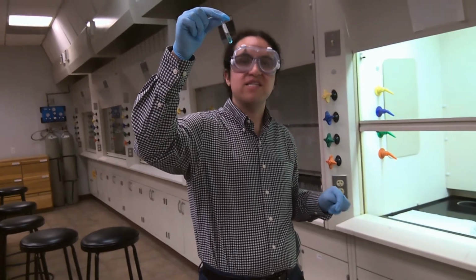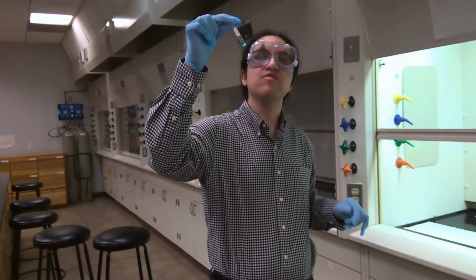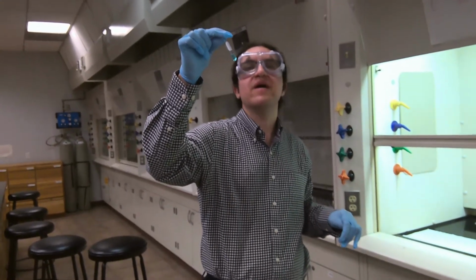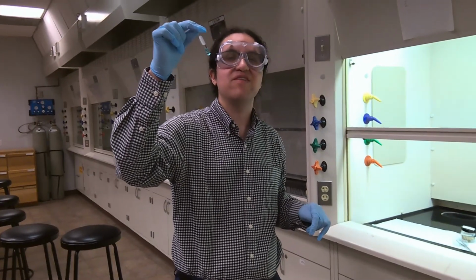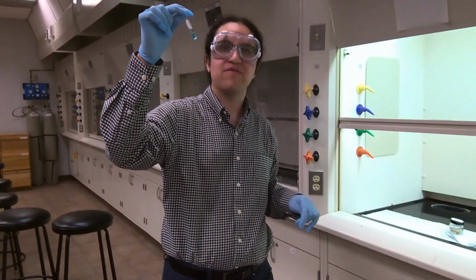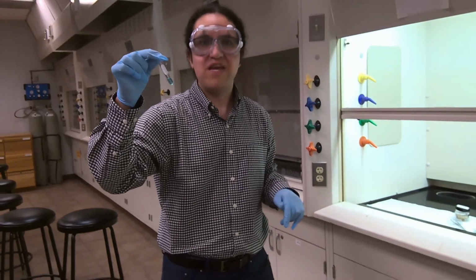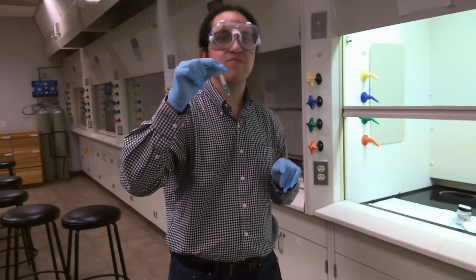Copper 2+ in our acidic sulfuric acid solution, we're now going to reduce our copper from copper 2+ to copper 0 using magnesium metal. Now this reaction is going to be accompanied by a vigorous generation of hydrogen gas, not from the reaction with copper, but from the reaction with our H+ in solution. That's why we have to add an extreme excess of magnesium. So I'm going to add a magnesium ribbon.